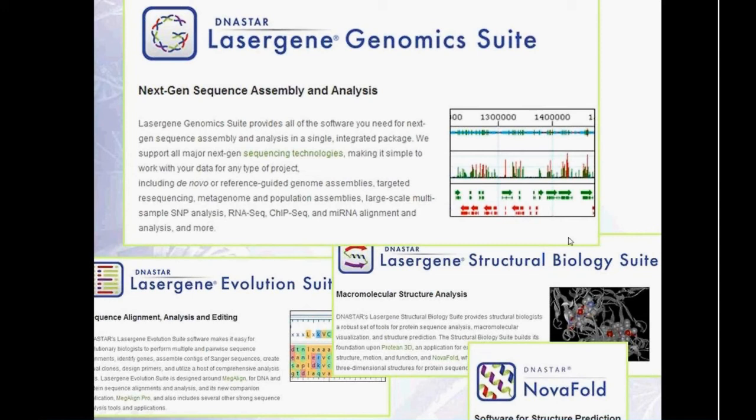And in fact, you can buy, in addition to a genomic suite, a complete DNASTAR suite that would include protein tools as well. So again, if you're interested in the software, we can provide you with all the details and the different options that you have.